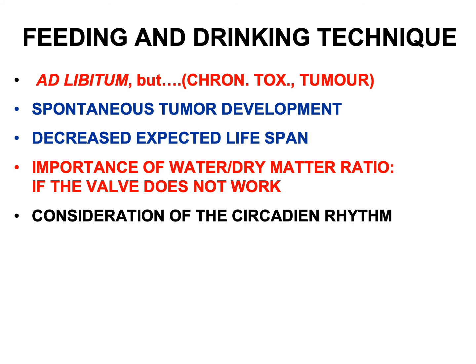The water and dry matter ratio is important, it is 1 to 1.5, 1 to 2, because if the valve of the drinker does not work, not only the water consumption decreases, but also the dry matter intake. Consideration of the circadian rhythm is also important.